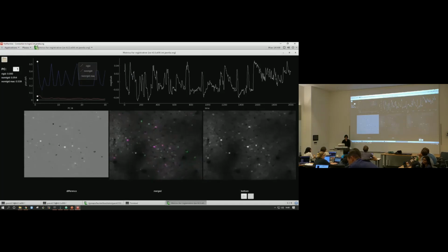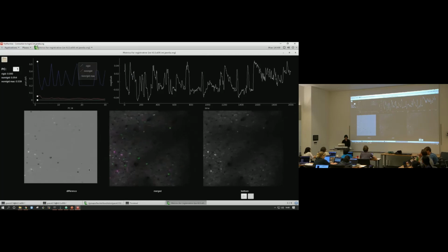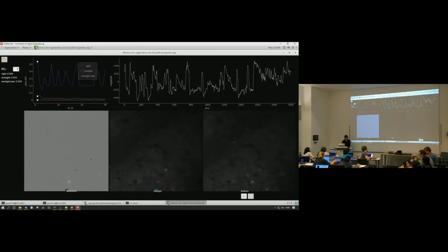The average is small on the right. Remember where we made this observation during Carson's talk, that the arrows were kind of messed up and jumbled? It's because it's so dark over there. It doesn't actually matter if we register well there or not, because we're not going to have our lines there. It's too dark. Even if we do have it there, we don't lose it. That will be where we get this relatively large pixel shift, because there's not enough SNR.